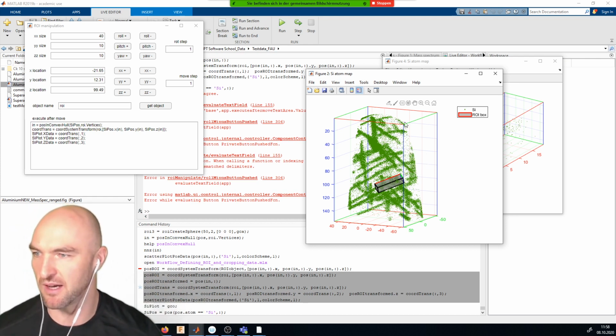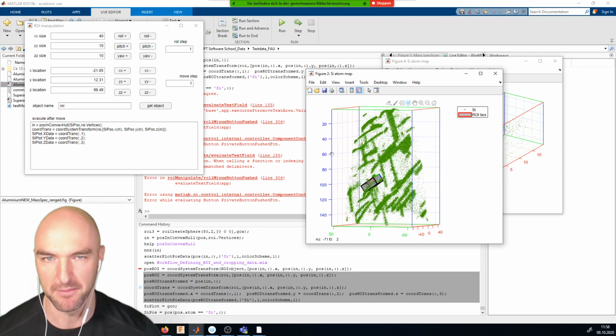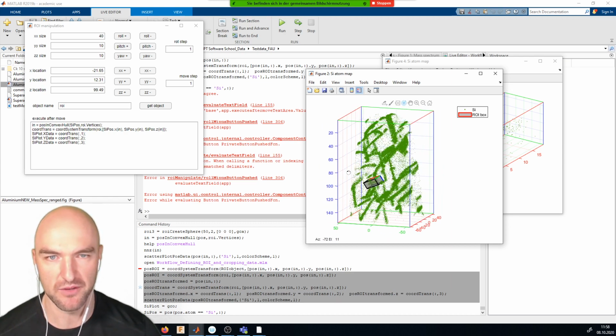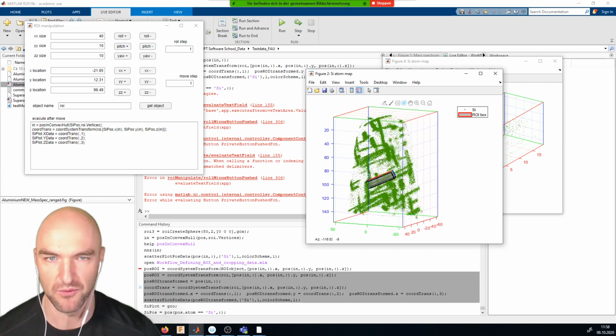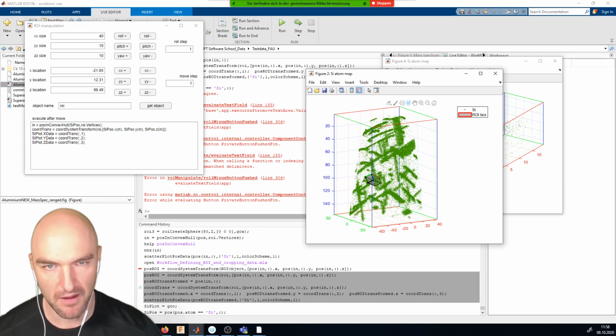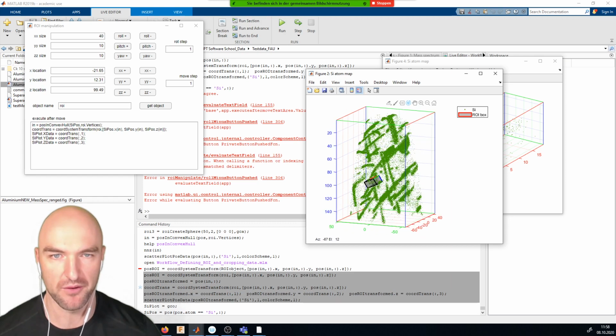And this gives you some pre-clipping in the code, and it would also make things a whole lot faster. Yeah, I will actually just quickly code that later on and put that in any of the material that you get later on, so that you have that pre-clipping implemented as well. Okay, but now we have a region of interest, and we know how to coordinate transform into the region of interest. And based on that, we can do quite a lot of analysis.